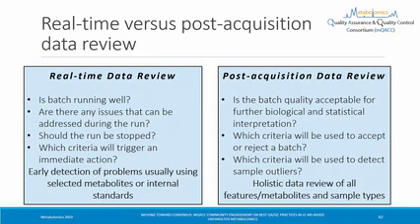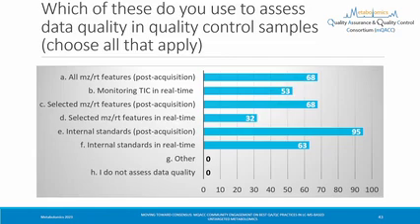So here in post-acquisition, we are really looking at holistic data review, and this is where we want to look at all the data, not just selected metabolites generally. And when we asked the question of the interactive forum audience here, the majority was using both. So 80% were using both real-time and post-acquisition, and only 20% were only using post-acquisition.